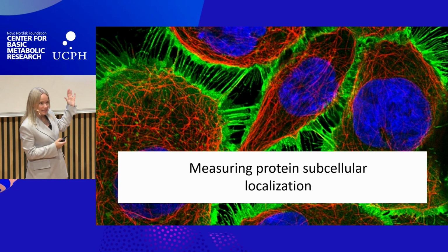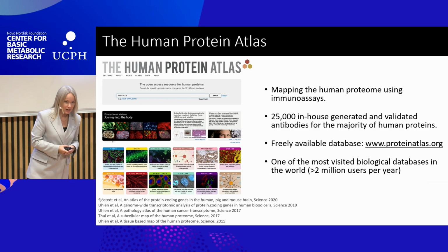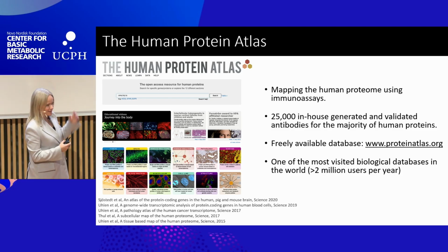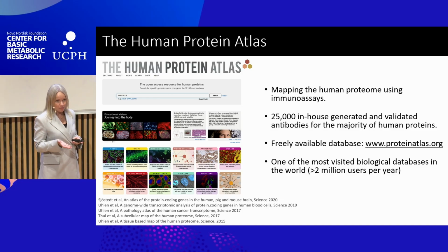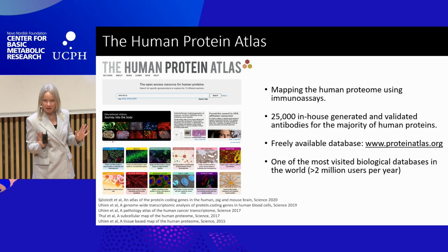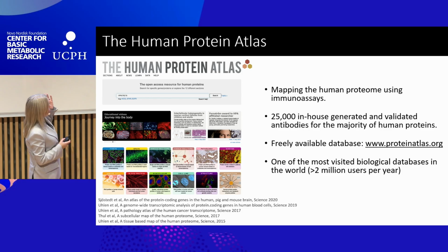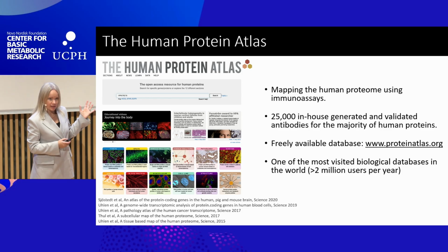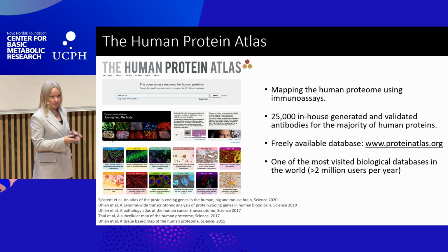And I will just give a basic intro to what we have in the Human Protein Atlas. It's a Swedish program that I hope many of you are using, hopefully on a daily, weekly basis, where we've generated antibodies for the majority of human proteins. And we've validated these antibodies extensively, and I'm happy to talk about that in the break if anyone is interested. But basically what we have is a proteome-wide library of binders that we can deploy in different assays to measure where proteins are expressed, for example, at the cellular or subcellular level or in biofluids.